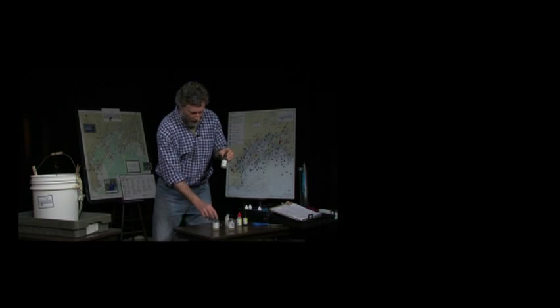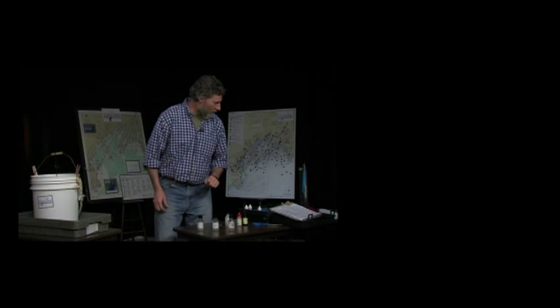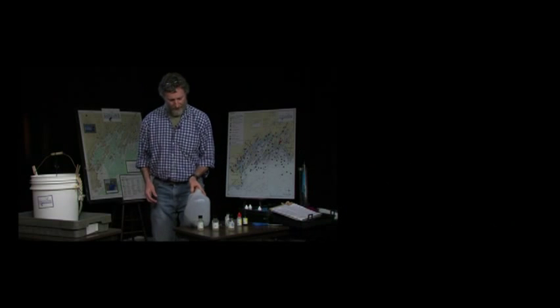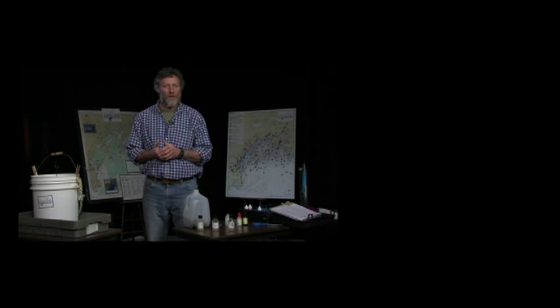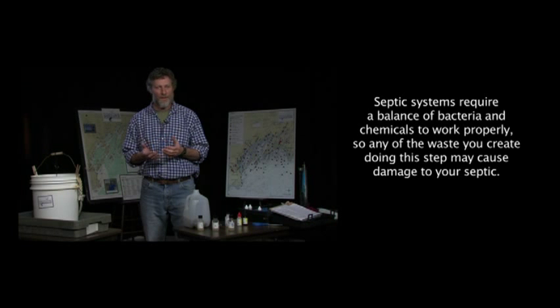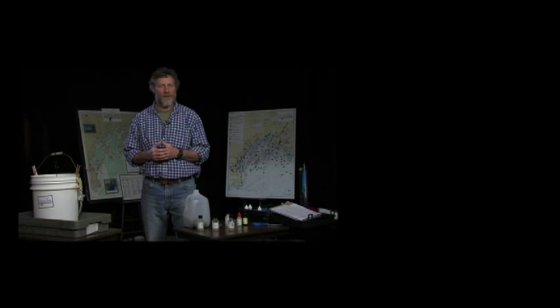So what I'm going to do is I'm going to talk about doing the titration. And we're going to do all three bottles for the titration. And when you do a titration, you are going to have some waste from your sample that you need to get rid of. Typically, if you live in a home where you have your own septic system, you're not going to want to dump any of this waste down your drain into your septic tank. Over a period of time, the chemicals can be harmful for the good bacteria that's in your septic system. So we don't want you to do that.